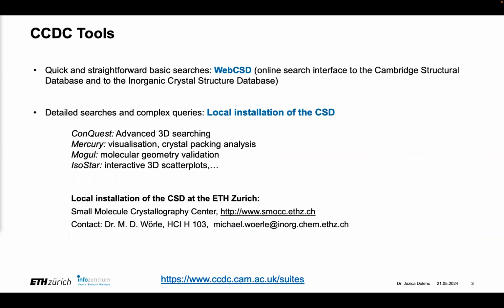Now, the whole database with all its sophisticated tools is installed at ETH Zurich at the Small Molecule Crystallography Center. And I'm not going to show you that today.